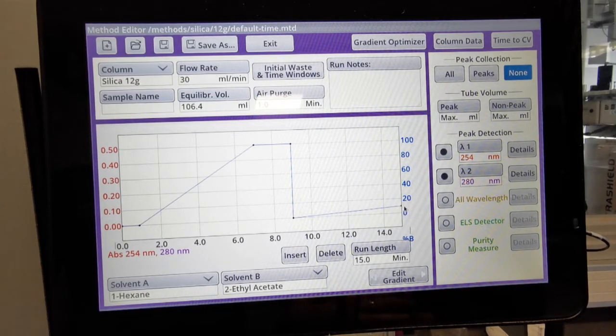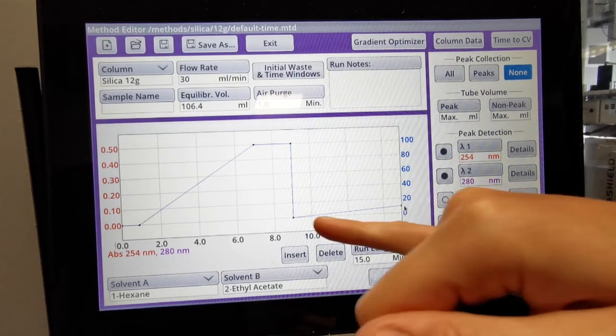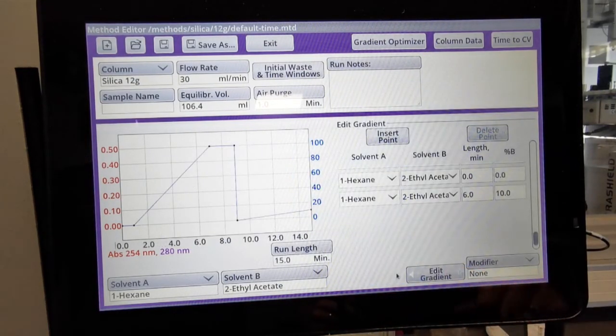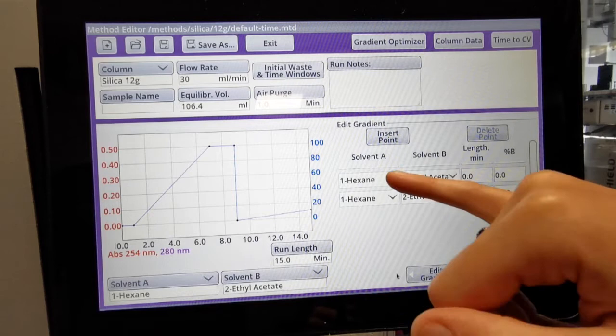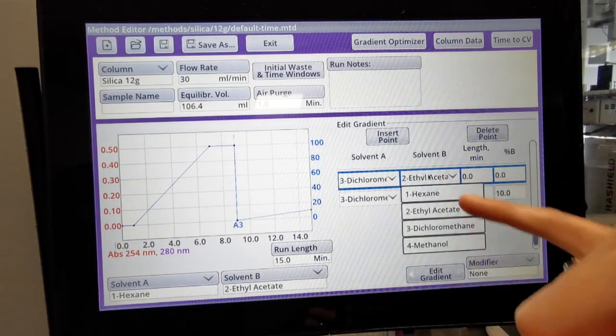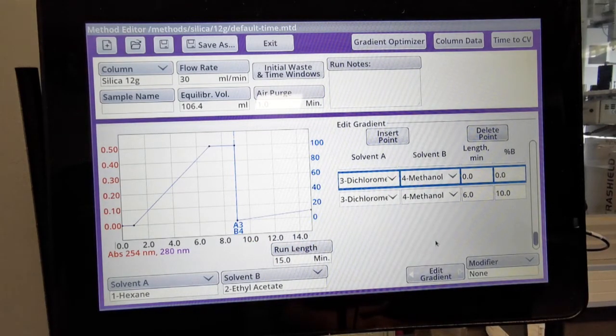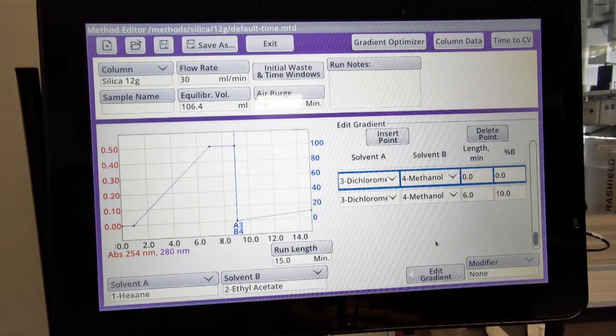In order to change this latter half of the gradient, I go into edit gradient and where it's set at zero here I just switch to DCM methanol. And as you can see here, from that point on it's switched from your hexane ethyl acetate to DCM methanol in order to elute your compound.